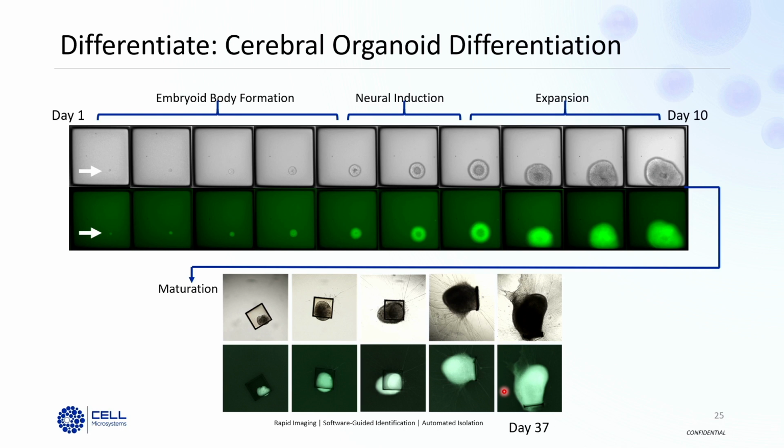Can you also transfer to a 384 plate? No, not at this time. Only 96 well plates, as well as PCR strip tubes and a PCR plate.